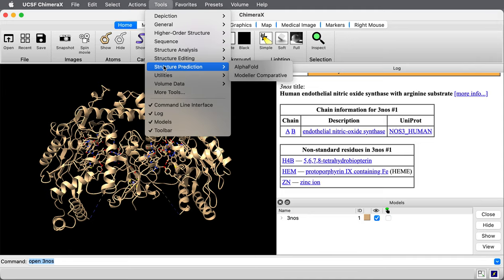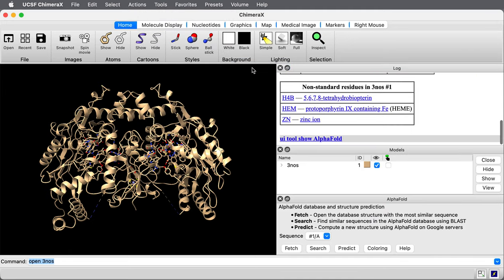I go to tool structure prediction AlphaFold. This is a new tool that was just added to ChimeraX. You'll need a new daily build of ChimeraX to use it from September 2021 or newer.